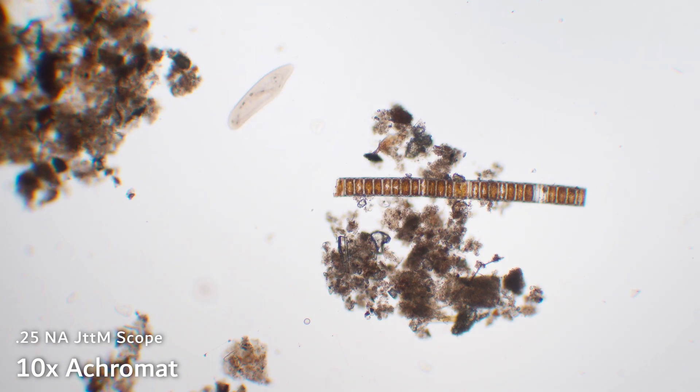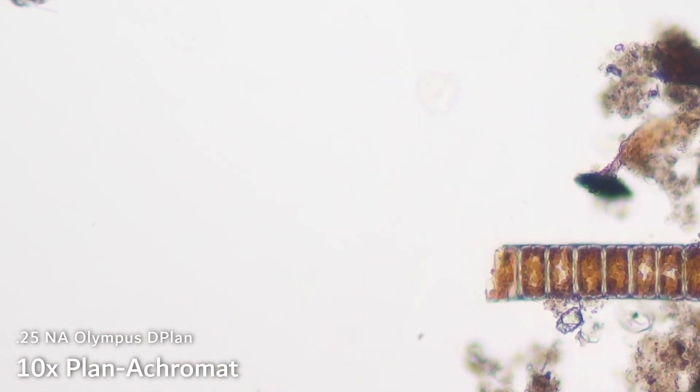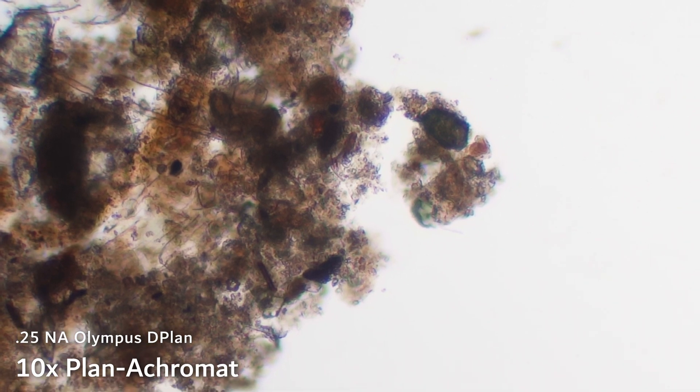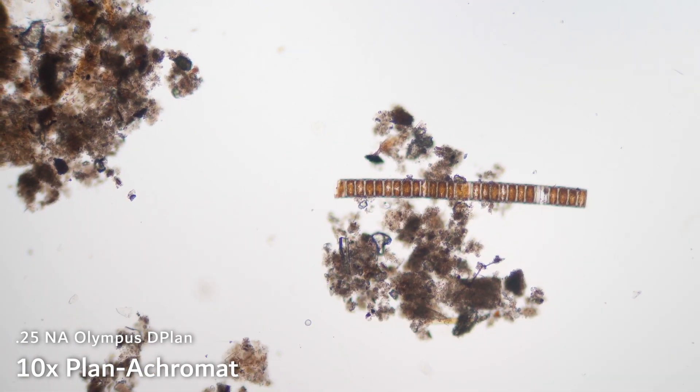But if you want to make nice videos or photos, then you might consider buying an objective that has field flatness correction. Those are known as plan objectives. I'm going to switch over now to an Olympus D plan objective. And once I get this nicely in focus, you'll see now that the crud up in the top left corner is nicely in focus while the center is also in focus. That is why plan objectives are generally recommended if you want to do a lot of video microscopy or photography. This plan objective is a plan achromat — it's an achromat just like the previous one. The "plan" refers to field flatness correction.